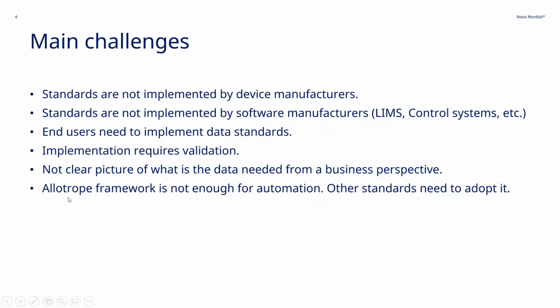And the last one, and this is nothing to do with Allotrope, but you might have noticed that our project is very strongly automation focused, and for us the data model is a very, very good help, but there's more things involved in what you need to do to actually control an instrument.